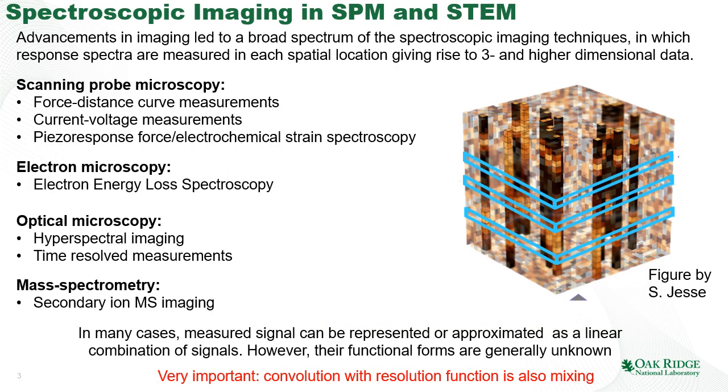Now, let's start with a brief discussion of why we even need the linear unmixing methods in scanning probe microscopy and in scanning transmission electron microscopy.